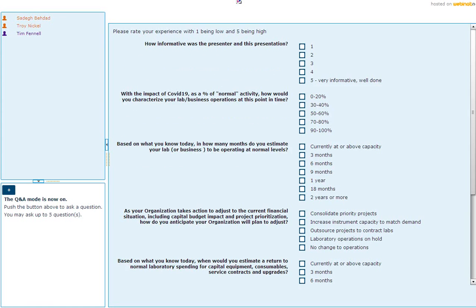So first question, actually there are a few of them on the flexometer test or the heat buildup test. Just in general, maybe just revisit the difference between the Goodrich flexometer and heat buildup, if any, and then the three temperatures, just repeat those three temperatures that you typically run that test at.